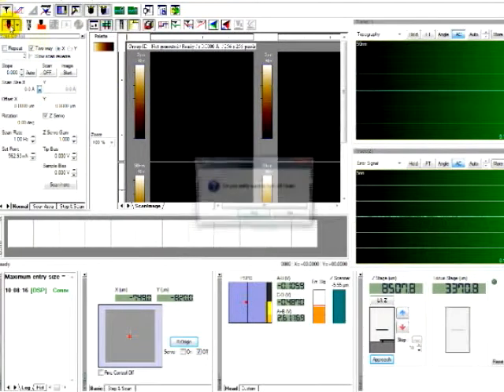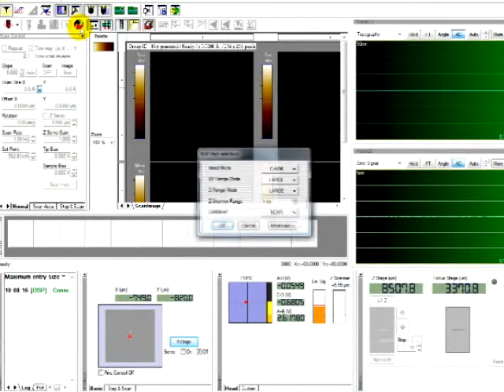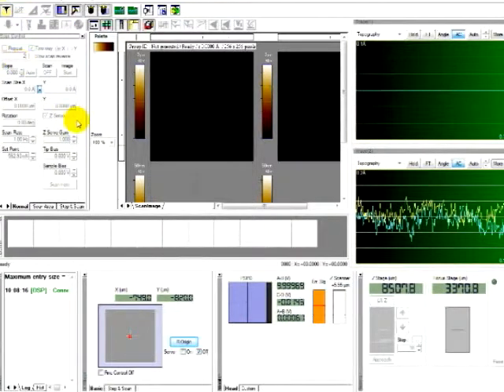Make sure that it is on contact mode. As you turn the laser off in XCP, then part selection will be activated. You can click on part selection and make sure head mode is CAFM. CAFM stands for contact AFM. And then also make sure you have the right cantilever DB. Then click OK and turn the laser back on.